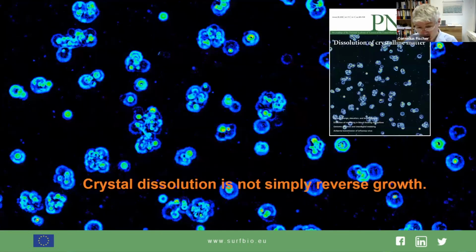So now we are back to the initial question: what about reactive surface area versus surface reactivity, and how to identify the reactive portions of a crystal? This kind of analysis, quantification, and parametrization of kinetic simulations has been largely driven by measurements using vertical scanning interferometry. And there's an example that illustrates what's going on on the reacting crystal surface.